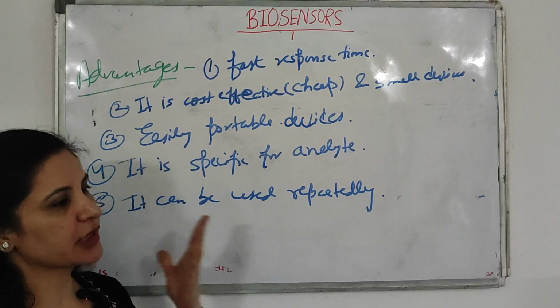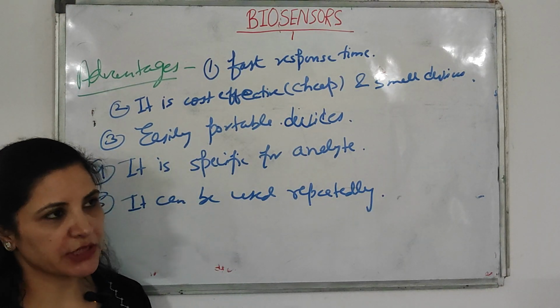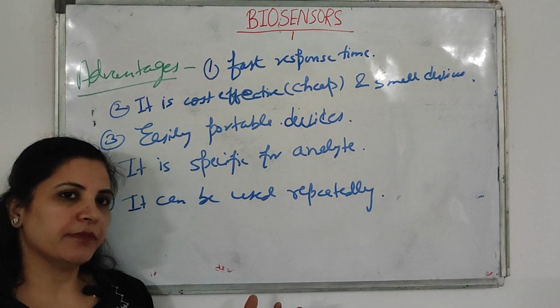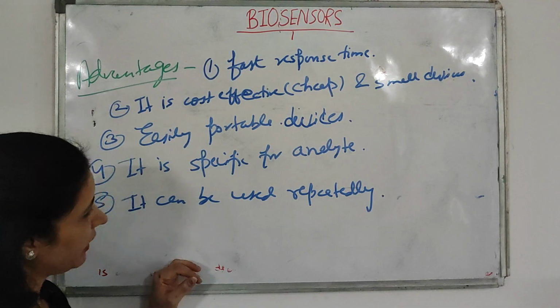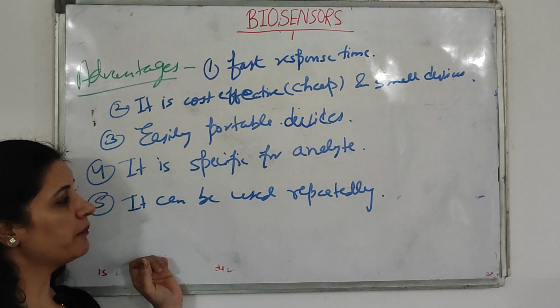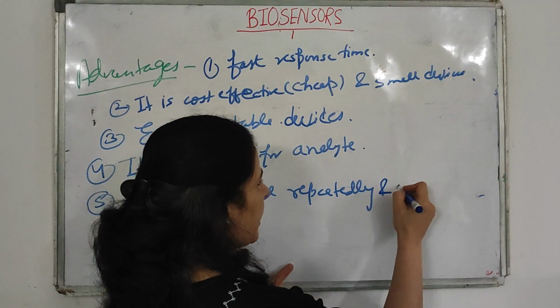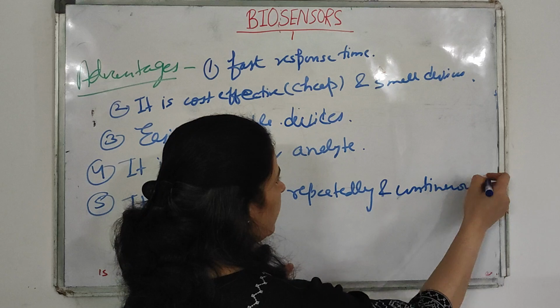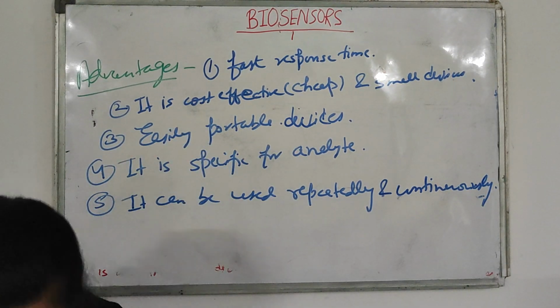First, the response time of this biosensor is very fast, and these are very cost effective, cheap, not very costly devices. These are small devices, so they are easily portable. You can carry them from one place to another very easily. These are specific for the particular analyte which you want to measure, and they can be used repeatedly and continuously. Alright, so these are the advantages.